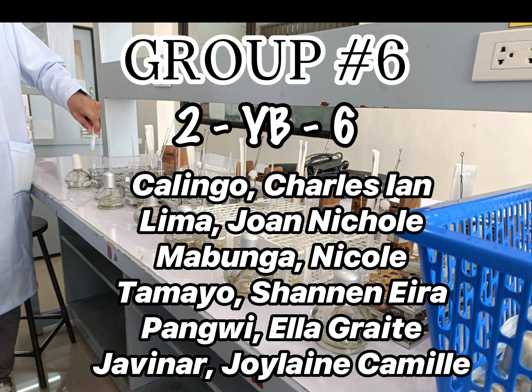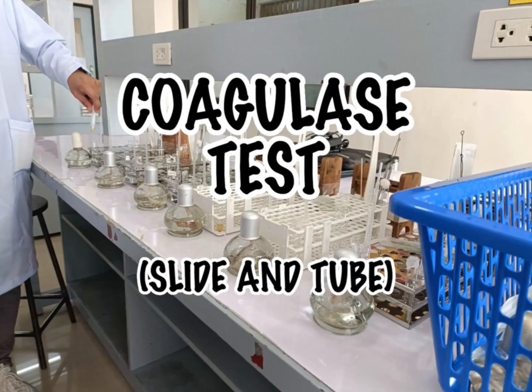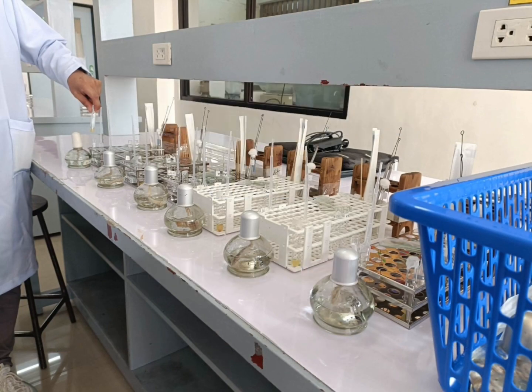In this video, we're going to perform different tests to identify and differentiate various organisms that we usually encounter in the laboratory. Since we are given an identified species of Staphylococcus, we are going to perform a coagulase test. The coagulase test is used to differentiate Staphylococcus aureus from Staphylococcus epidermidis and other coagulase-negative Staphylococcus.